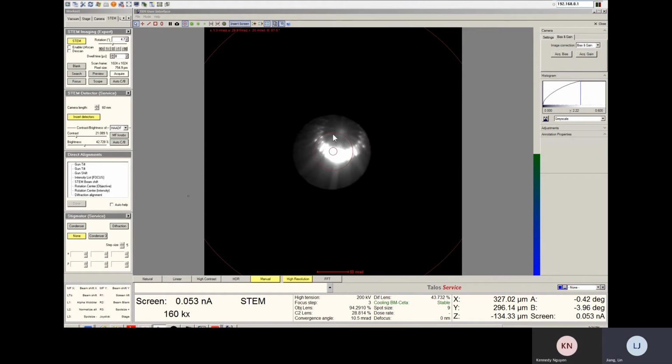And then you know your Kikuchi pattern is here. You probably want to go alpha first, move to the center, and then you need to do beta tilting. So you want to move your center to the bottom, then you're going to do negative beta tilting. You calculate how much the distance is between the center of your screen and the crossover of your Kikuchi pattern.